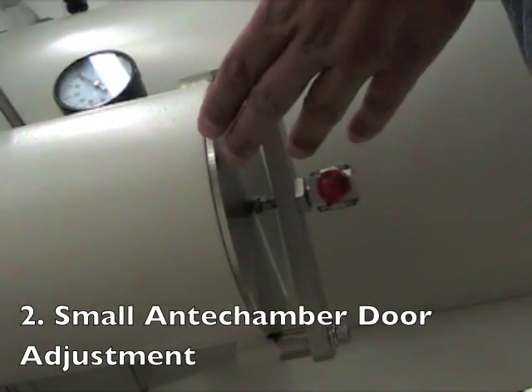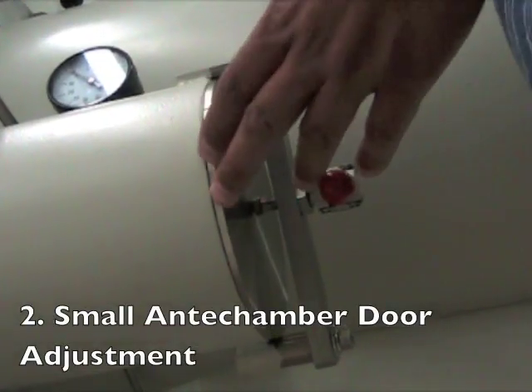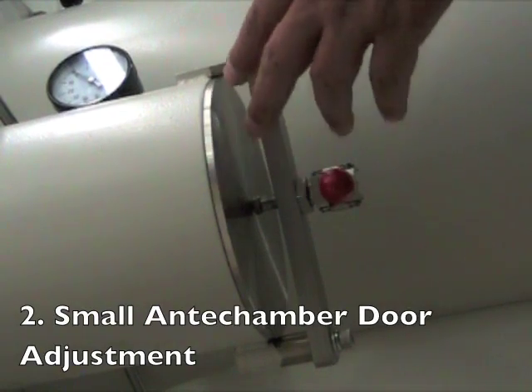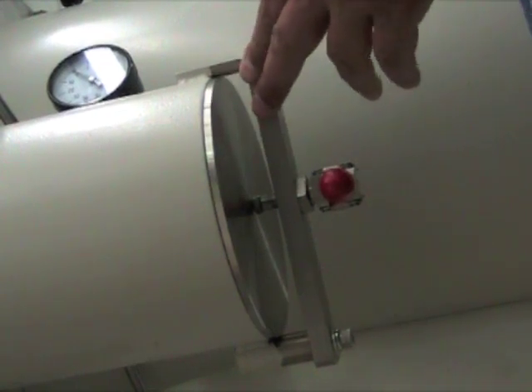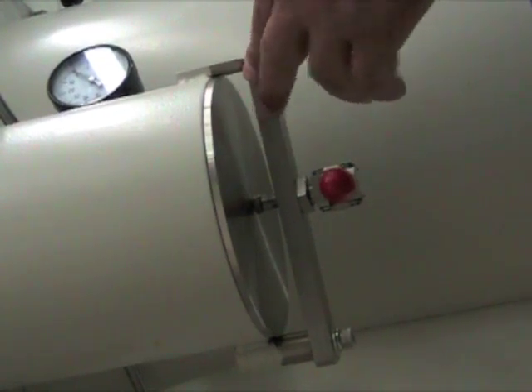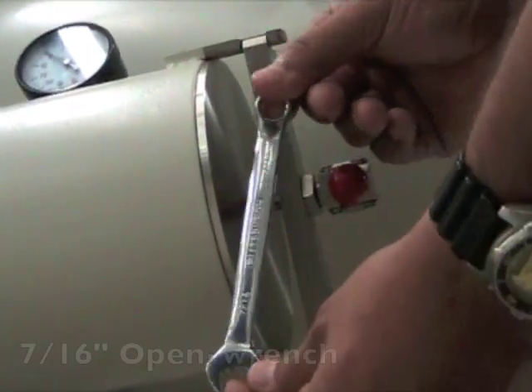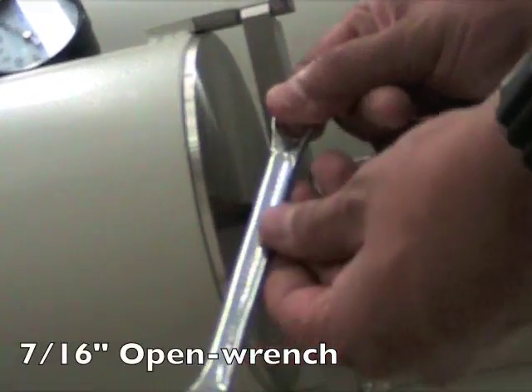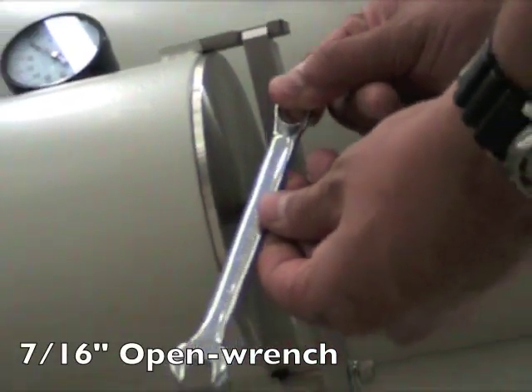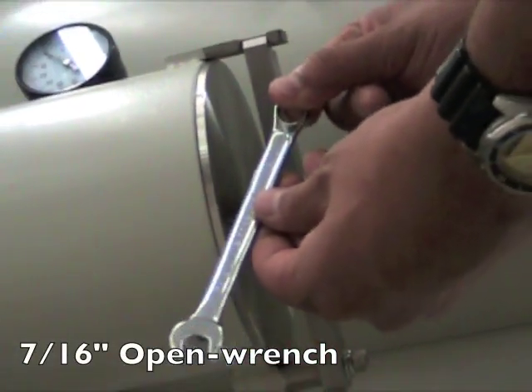And now on to the small anti-chamber door adjustment. This procedure will require a 7-16 inch open wrench.